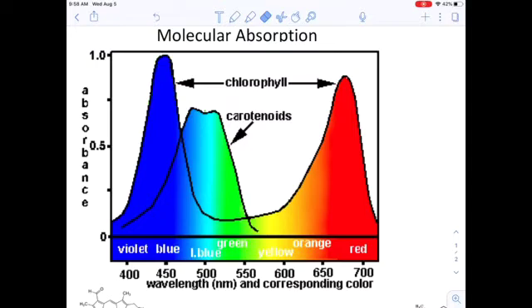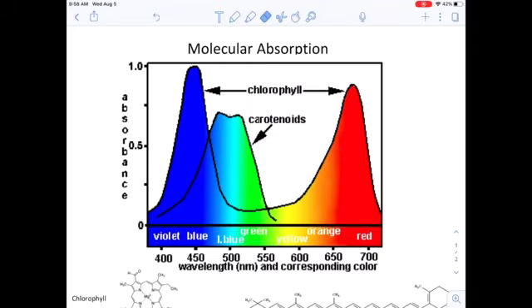So our first step that we have to do when doing any manner of Beer's law investigation is to develop a graph like this. And what you need is a device that will scan a sample of your material, and it will scan it from 400 or so to 700 or so, and tell you which of these wavelengths is a high absorption and which of these wavelengths is a low absorption, so you can then tailor your investigation to pick something that is going to be up here near the top of the scale and not near the bottom.